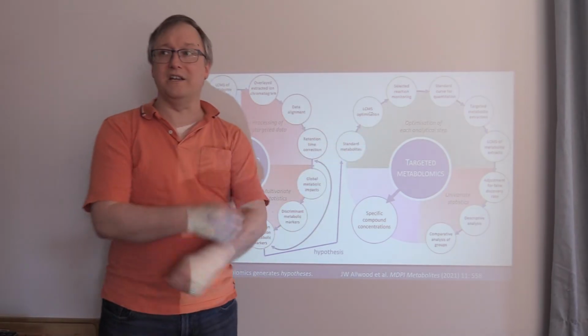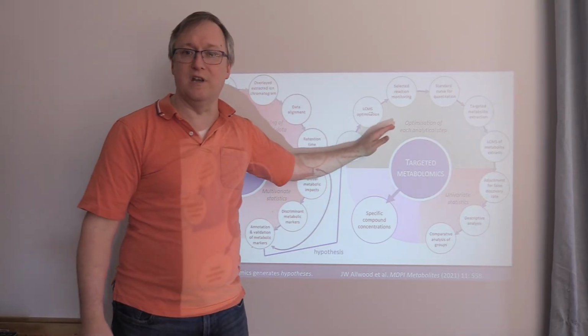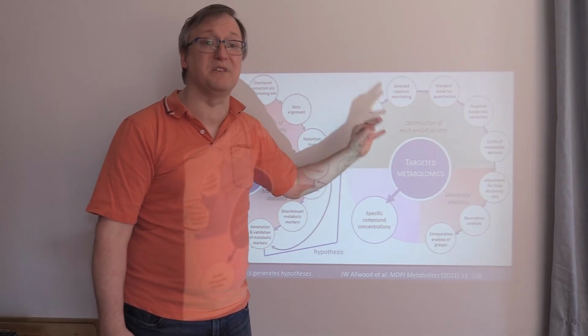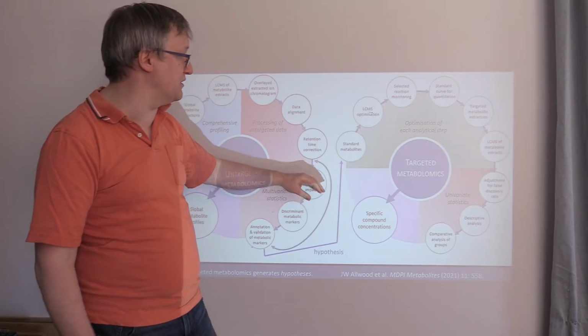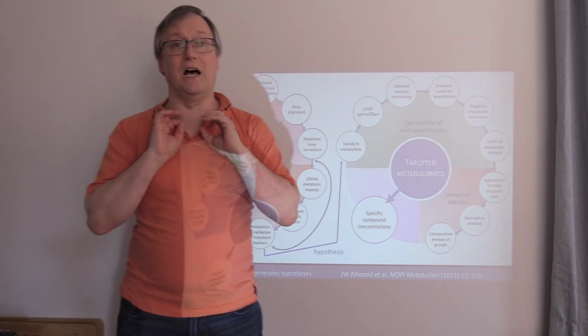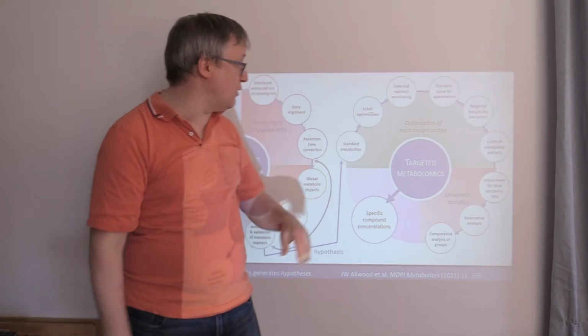We're no longer trying to tell information about every molecule in this class. Now we have the specific need of quantifying just this subset of putative biomarkers. Okay, so we're going to need standard metabolites, which is to say chemicals we can spike in that allow us to quantify these.